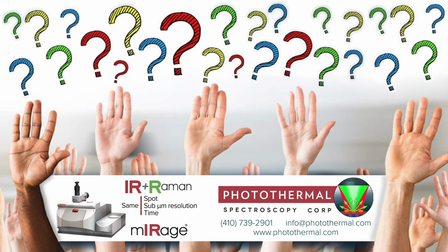I think the simplest way I can try and explain this, and of course Mie scattering is a very complex phenomenon, but one that's very obvious in the spectrum, is that in regular IR, so that's FTIR and some of these other QCL techniques, you've got a wide range of wavelengths, all of which are interacting with the edges and the particles in very different ways and scattering in different ways. So it's the broadness of the infrared radiation, which is a negative in this case, because you're also detecting on the infrared.